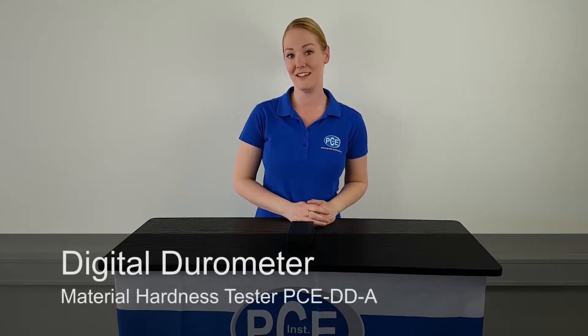A very warm welcome to PCE Instruments. Today I will show you the Digital Durometer PCE-DD-A.